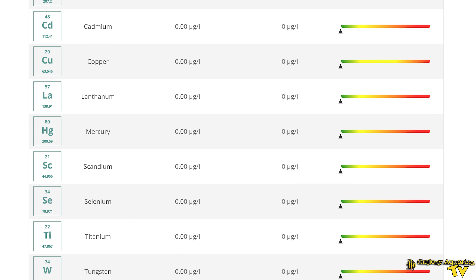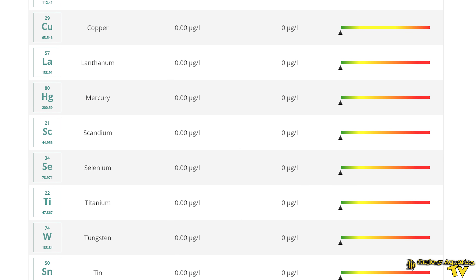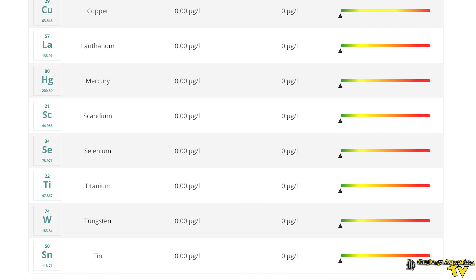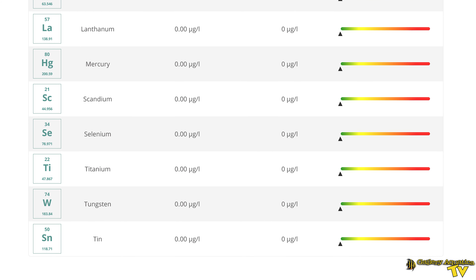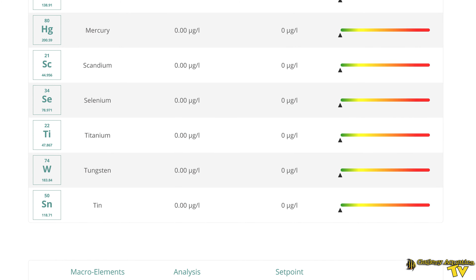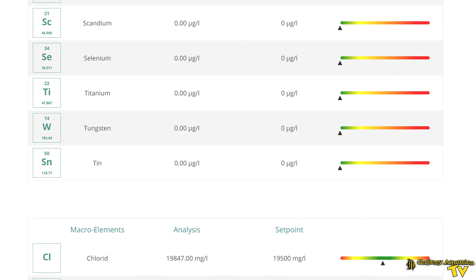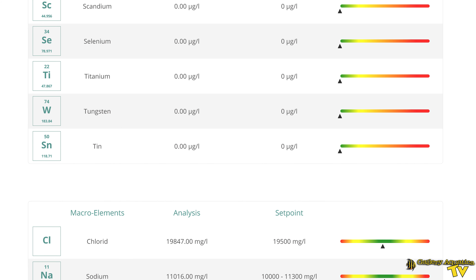Triton makes it very easy to interpret your ICP results because they have this sliding bar — green is good and red is bad. So even if you don't know a lot about the specific elements that have been tested, you get this guidance as to how much of a problem any given element is.